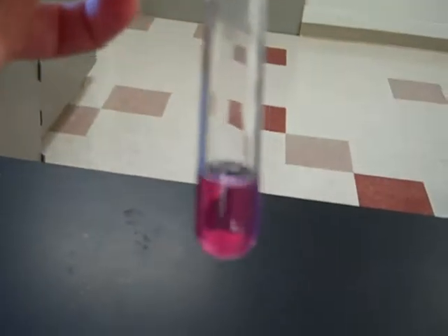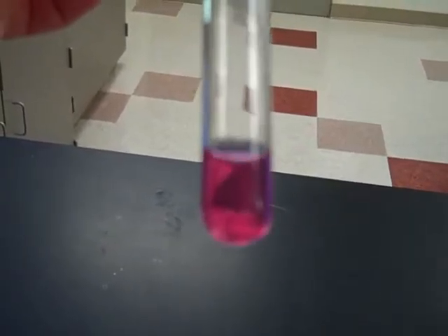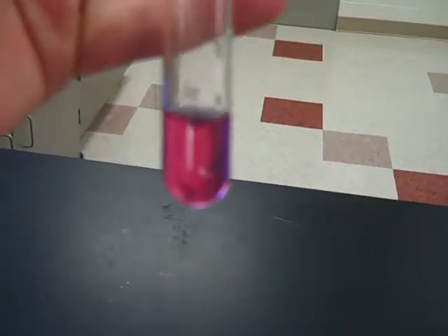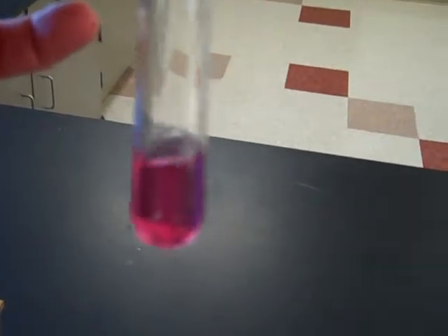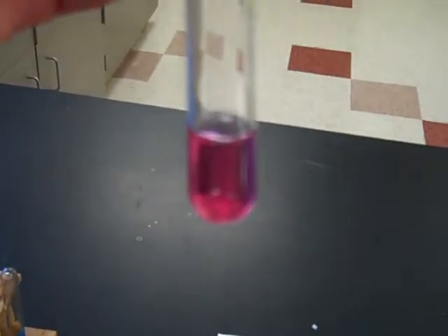So upon mixing of the 2 contents, you can see that in the container it is now a pink purple color. The test tube has not changed in temperature, so no temperature change. So you need to decide if combining cabbage juice and vinegar, along with the change in color, is a physical or chemical change.